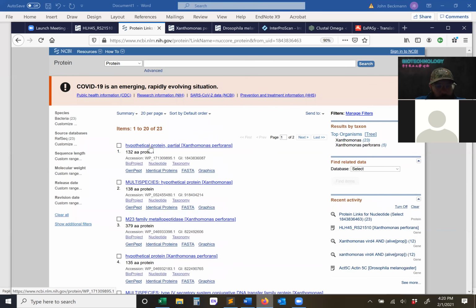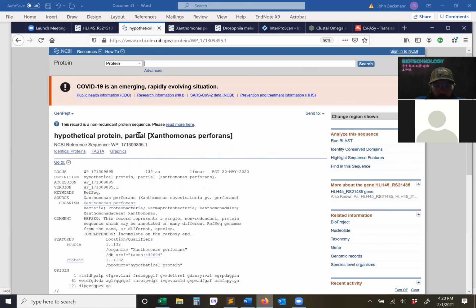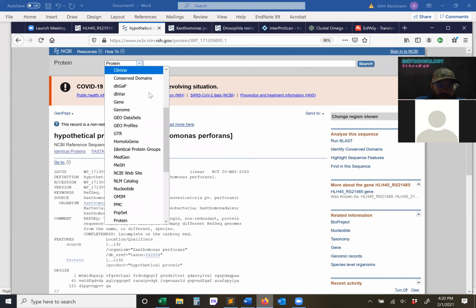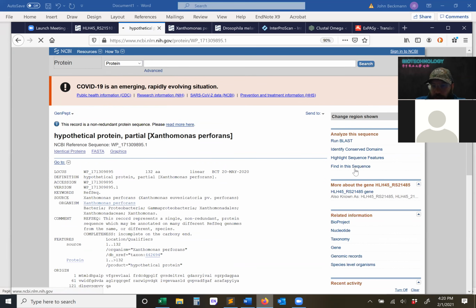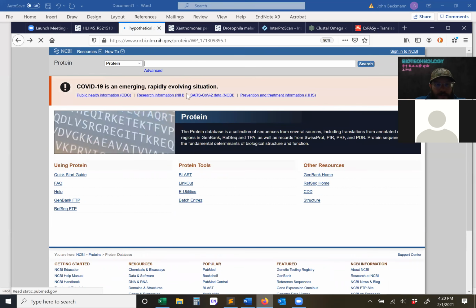I think I just clicked that protein button and it gave me the protein that associates with that gene. Let's test that. And the way that we can test that is with the conserved domain database. So when I have a protein accession, and you can tell it's a protein because the tab now says protein, if you click identify, whoops, something clicked funny.